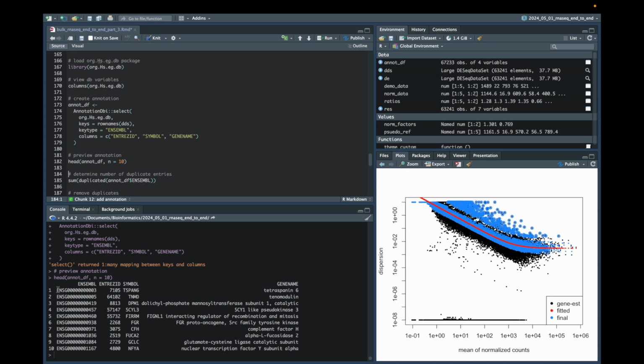And we can see now that we've effectively got a lookup table that has the information for the gene IDs that we have in our data, and we've added the matching Entrez ID, the matching HUGO symbol, and the matching gene name to each of those observations or Ensembl gene names. So as I said earlier, we can almost ignore the fact that we've got a one-to-many mapping between the keys and columns in our data, because actually removing duplicate entries is fairly straightforward.